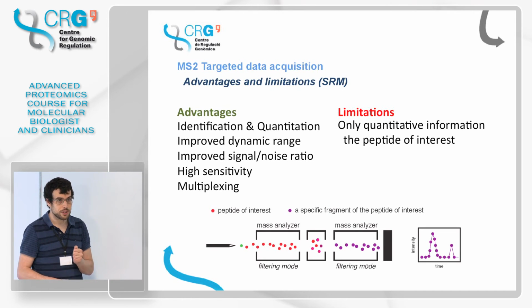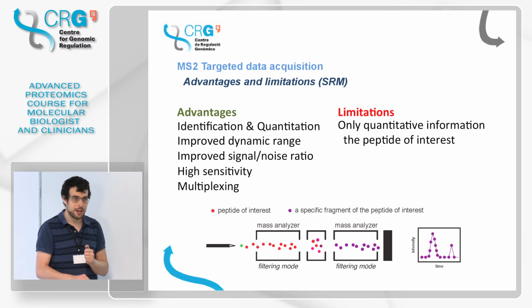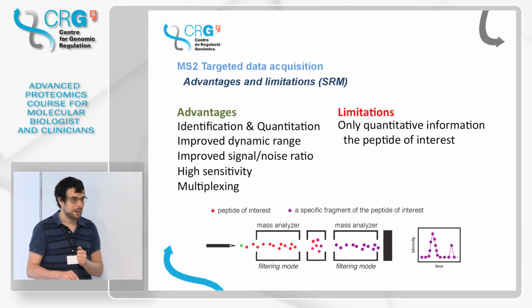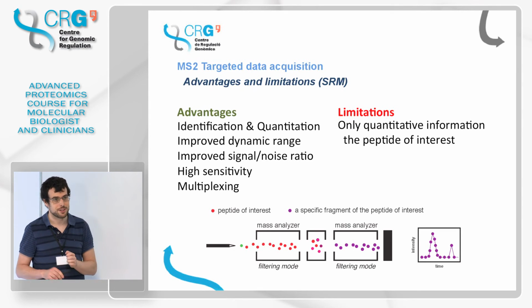And also, unfortunately, there are two peptides that have the same weight and also have fragments that have the same weight. And this is why, instead of one single nice peak, we get some interferences. So it's also possible to get more than two. Yes. Yep.